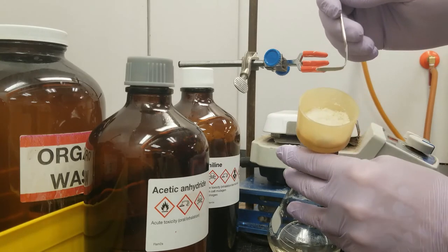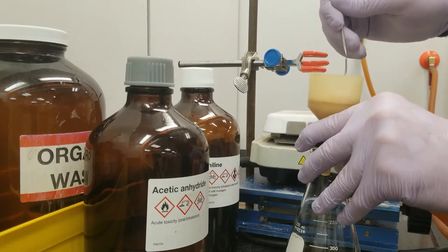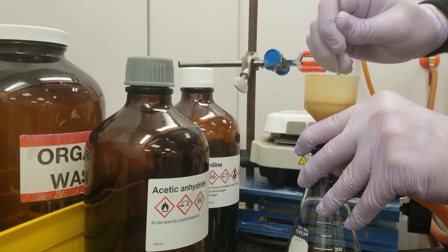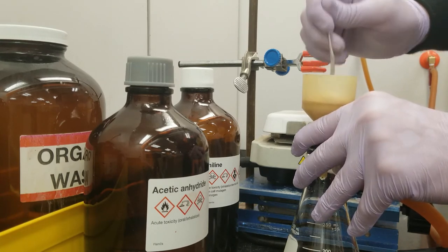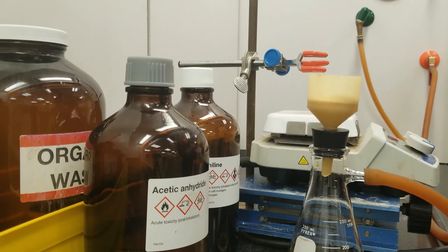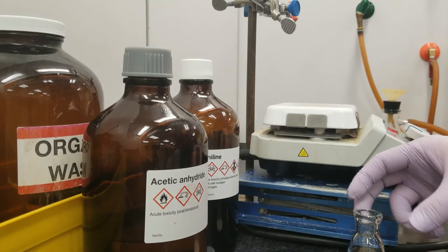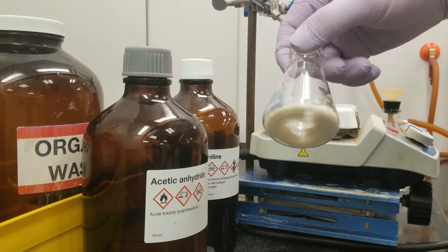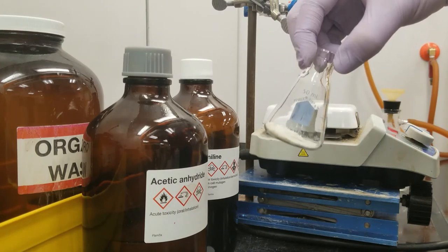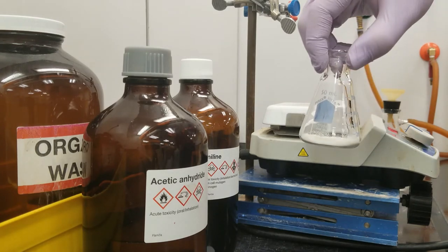You can see this tan solid that we've got right now. After recrystallization, I expect that the acetanilide we're making is going to be a nice bright white. We've got this tan crude powder of acetanilide now — it looks pretty impure, but we're going to work on that right now by recrystallizing it in water.